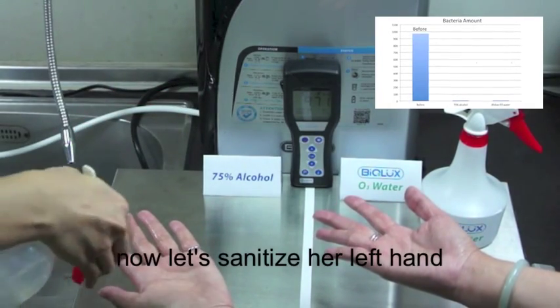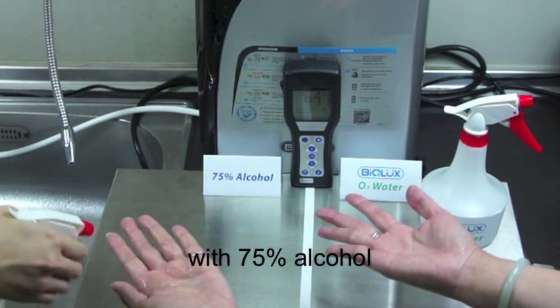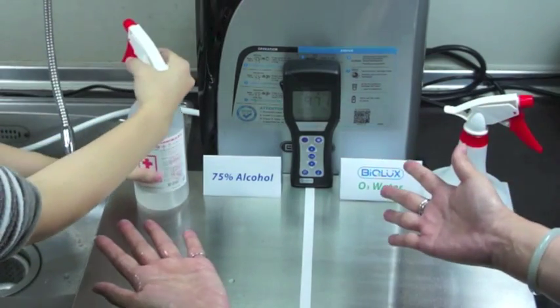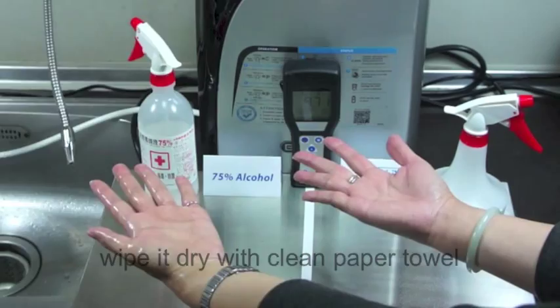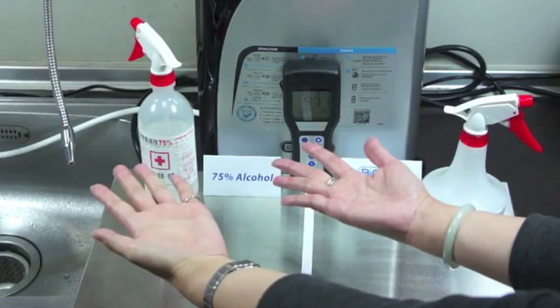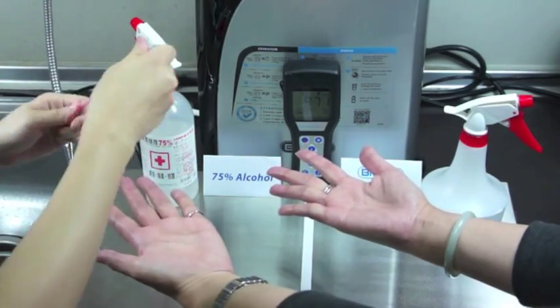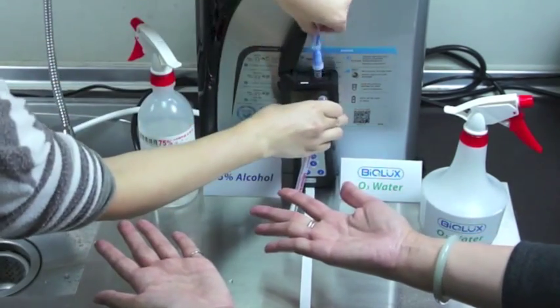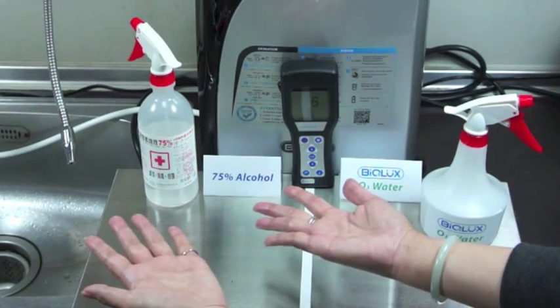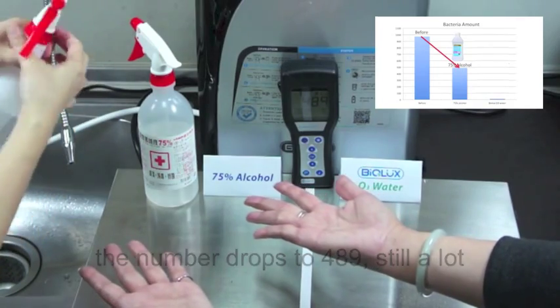Hmm, quite dangerous. Now, let's sanitize her left hand with 75% alcohol. Wipe it dry with a clean paper towel, then collect a sample from the left hand. The number drops to 489 — still a lot.